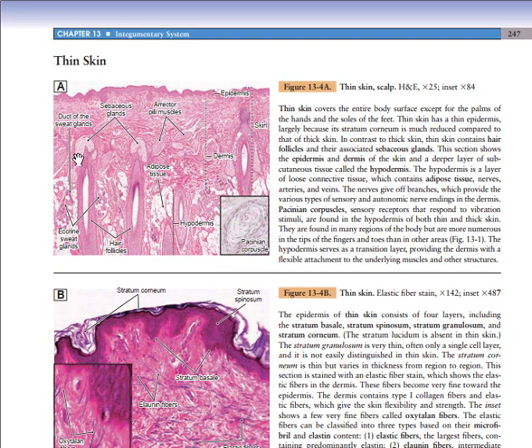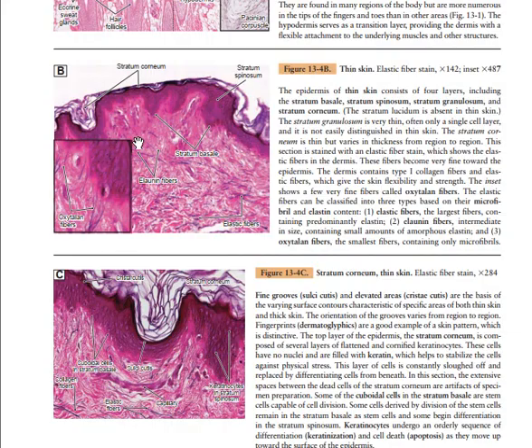That's why you see sebaceous glands there, and you see erector pili muscles in the dermis. The epidermis is not going to constitute the stratum lucidum. You are going to have the ducts of the sweat glands. As you can see here, you have the eccrine sweat gland, which drains directly onto the skin. Then you have the apocrine sweat gland that drains into the hair follicle.